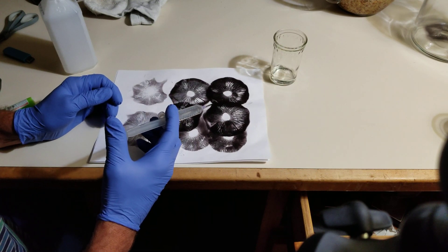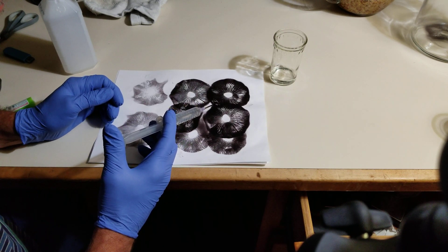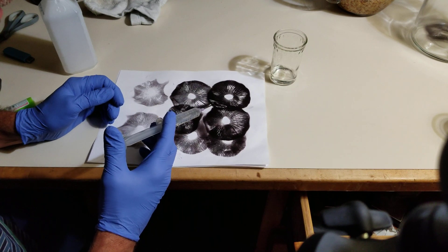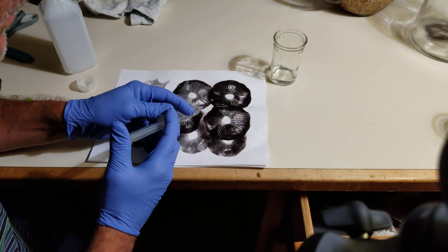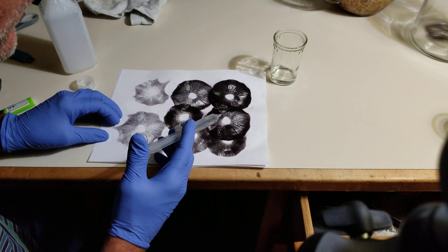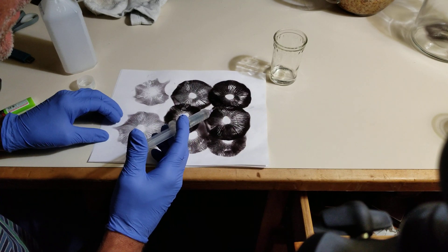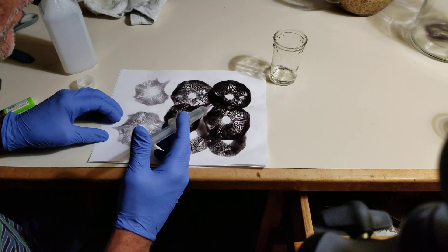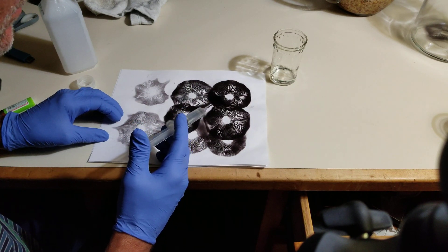And you can see the spores, almost powder-like. You want to get a lot of this material in here, and then we're going to puddle this up. This water right here is filled with spores — just completely millions of spores.